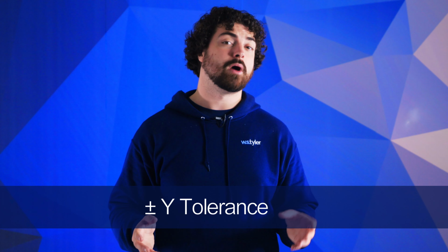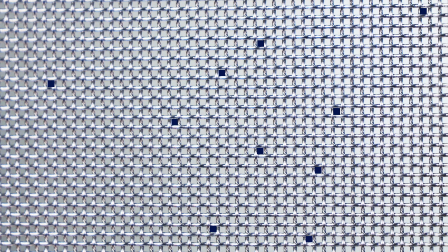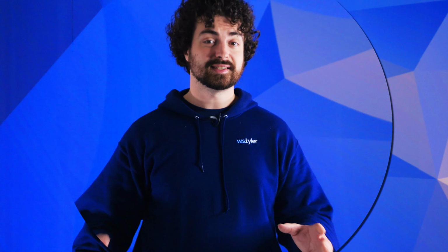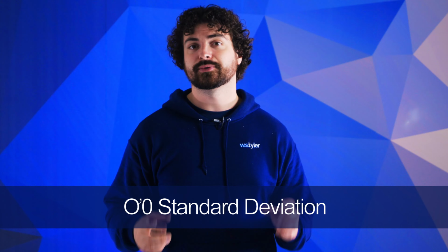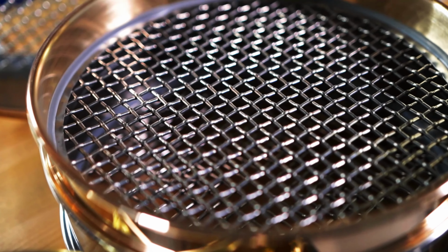The ±Y tolerance requires the mean value of the apertures measured to be calculated. The mean value of the apertures in the proximity, however, is not. Instead, the mean value of a wide range of apertures spanning the diameter of the test sieve, both vertically and horizontally, is calculated. The standard deviation is based on the measured results in their entirety. It is put in place to highlight the total number of apertures that must be measured to generate results that are statistically backed by data.